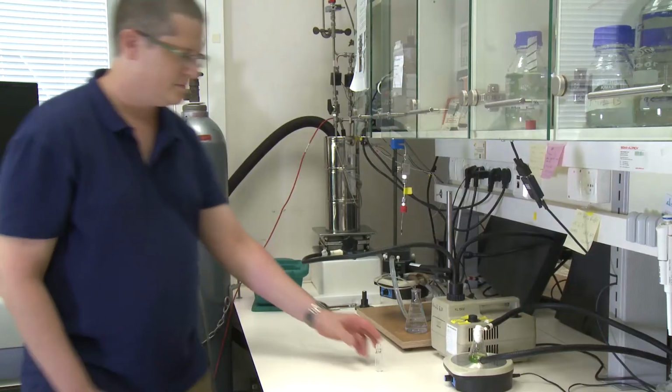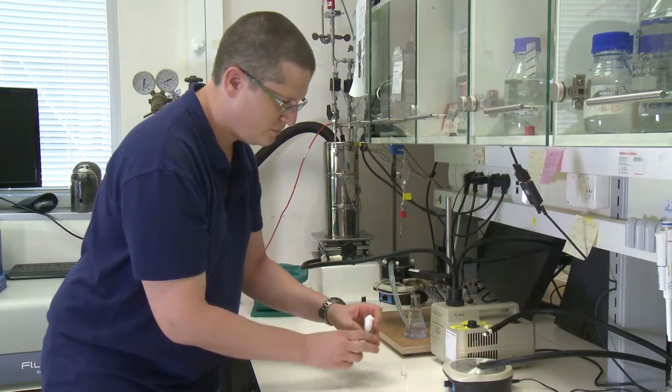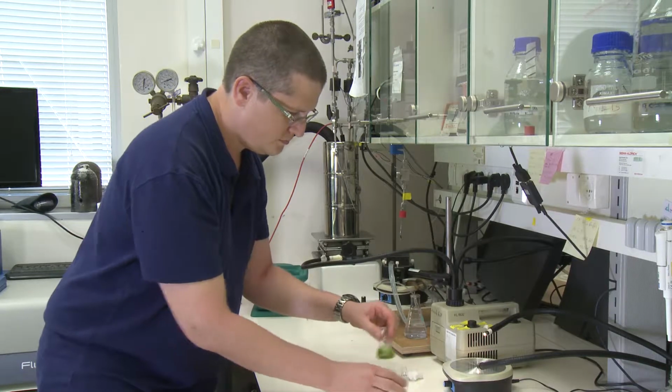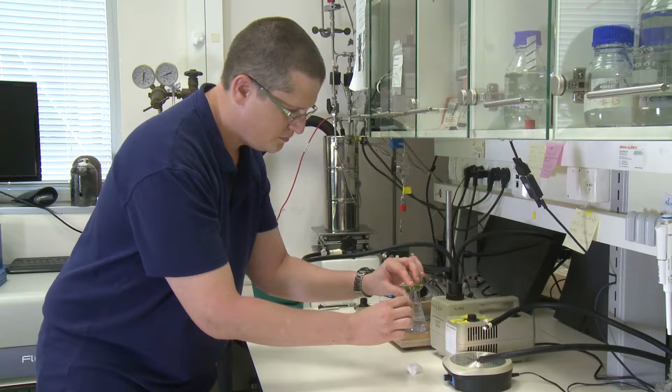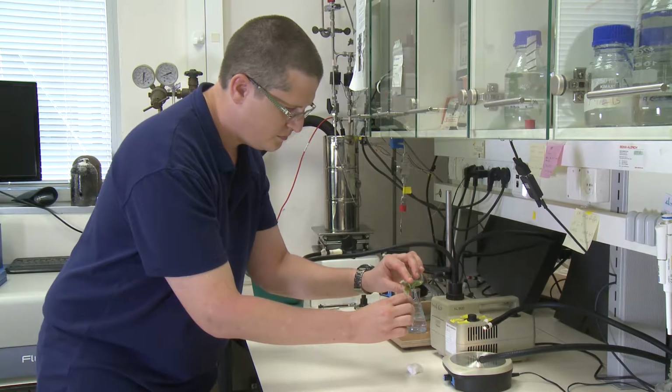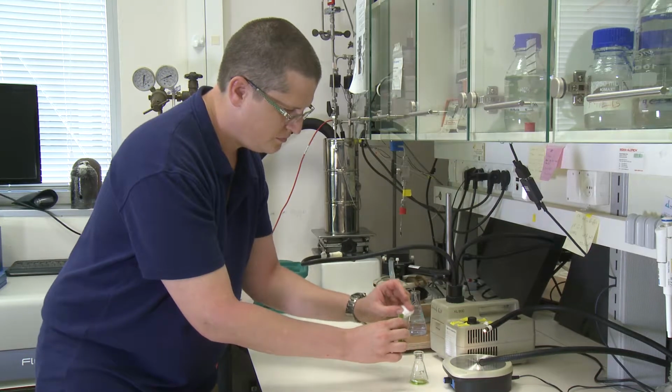All right, so Yiftach, can you describe what Oded's doing as he's preparing the experiment? So Oded is now taking the algae, he mixed it to make it homogeneous, and then he poured it to fill the cuvette completely. We can't afford to have any air inside.